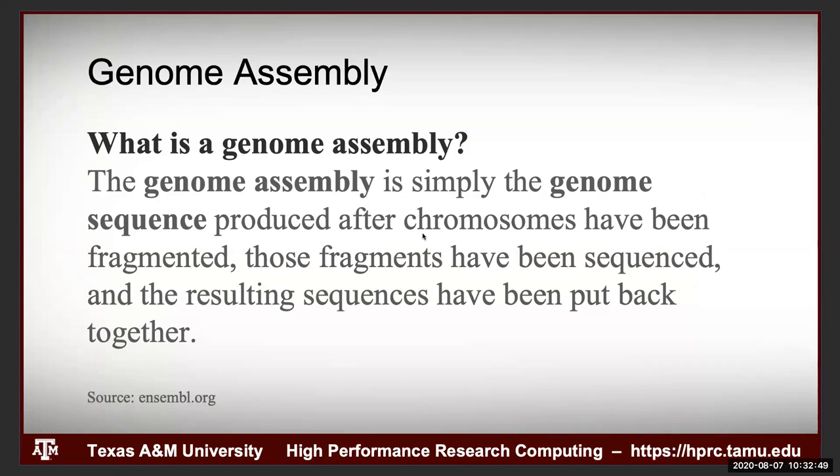I will assume you have knowledge about sequencing and other things. So I'm gonna start with genome assembly today. Genome assembly is a very difficult task in bioinformatics. Actually, I would say it's probably one of the most difficult tasks in bioinformatics. So what is a genome assembly? Basically it's trying to put all the pieces together to come out with a chromosome sequence.